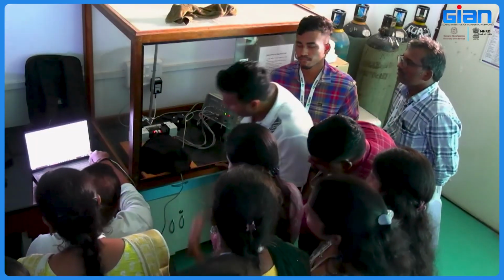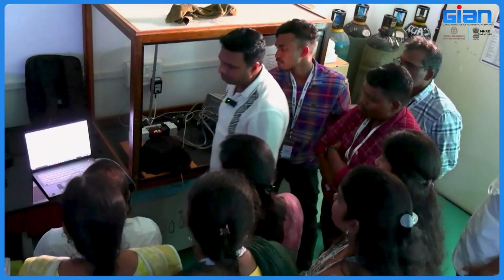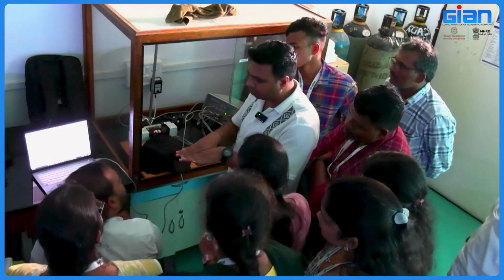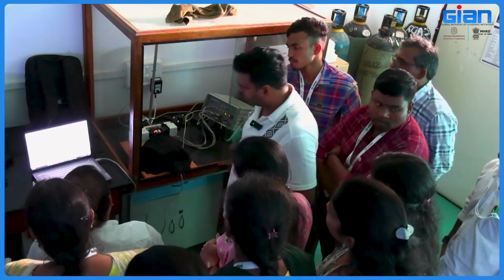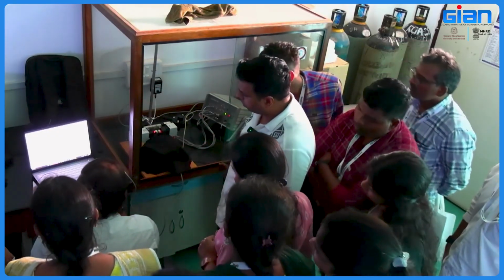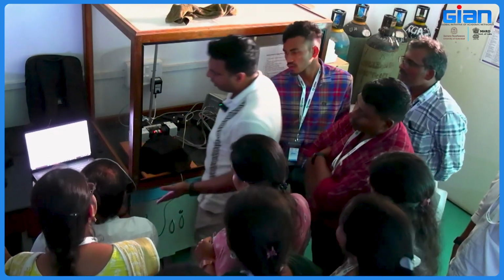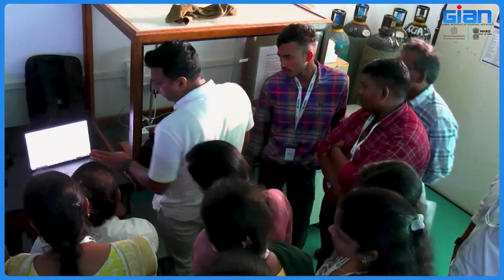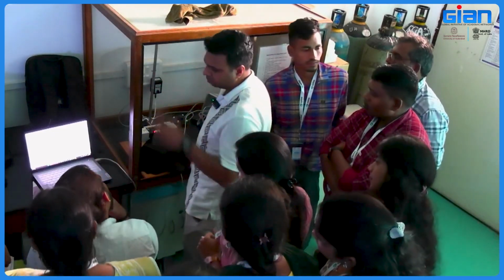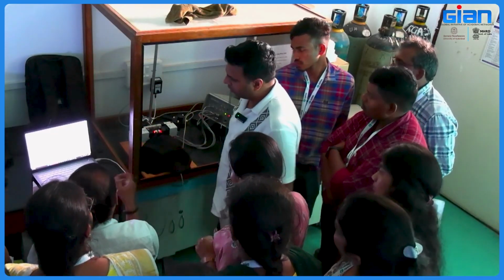What is this, plus 0.384? Oh, that is the voltage change, nothing else. Because, I told you, you are getting it to a baseline balance. While running a light curve, this should be more or less stable. It should not deflect too much. If it deflects too much, then there is some problem with this machine.